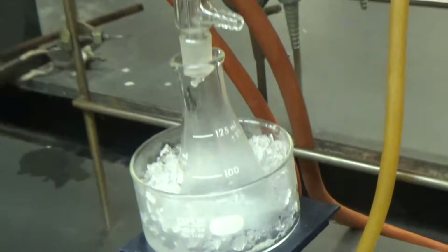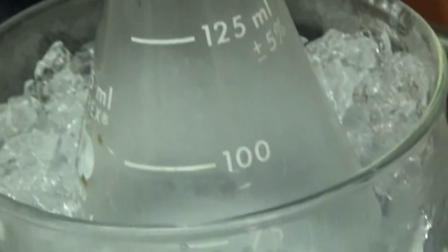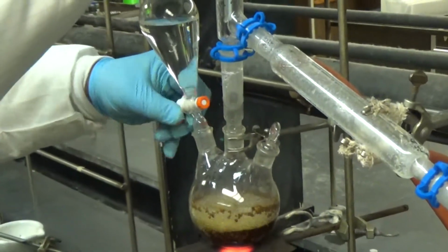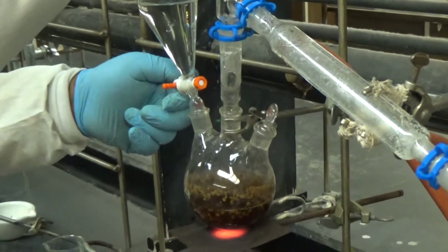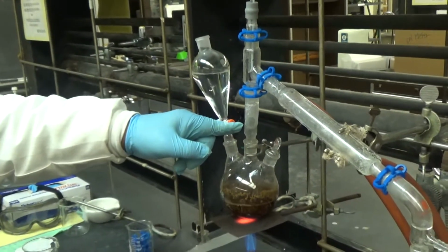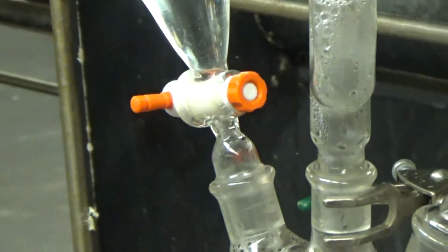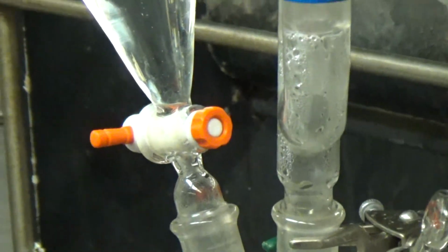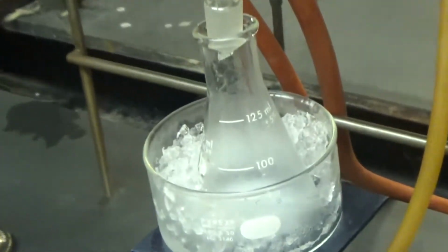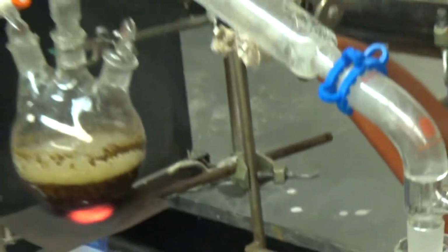So how much are you collecting total? 75 milliliters, so you've got a ways to go. Meanwhile, here and there, you'll add more water. Gently pour a little bit of water in, and close that again. If this were over here, it wouldn't be possible because it would be too hot. That's why you have the valve on the left, otherwise you're going to burn yourself on the hot glass. We'll keep going and keep collecting for a total of 75 mils. We're at about 30 now. So we'll come back in a few minutes.